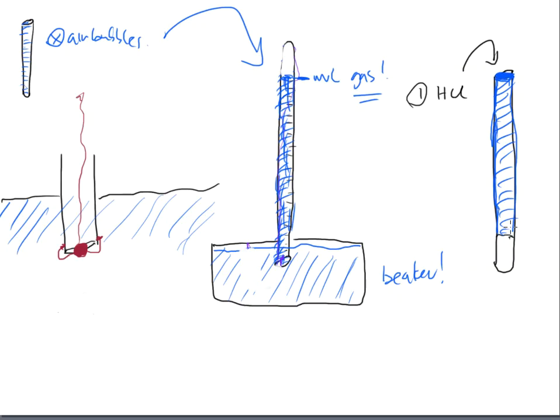So water is going to sit here, and HCl is still going to slightly be on the bottom. These will not be immiscible liquids. They are miscible with each other. But that bottom HCl will be denser, and it will settle to the bottom, and it will stay at the bottom unless you disturb it a lot.